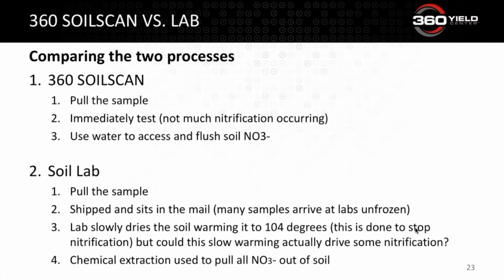But what we're wondering is if in some cases, that slow warming actually drives the nitrification in the sample. I'm not going to sit here and say that's absolutely changing the sample, but it makes you think and wonder as you start looking at some data, could that be part of the process? And again, not bad, just different. It's the standard benchmark process that's been used.